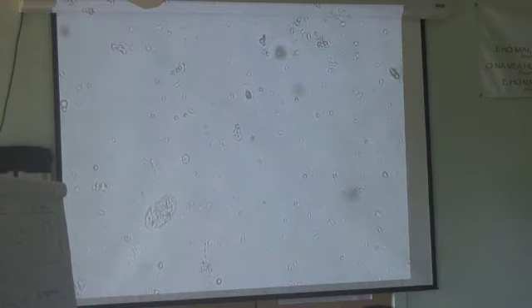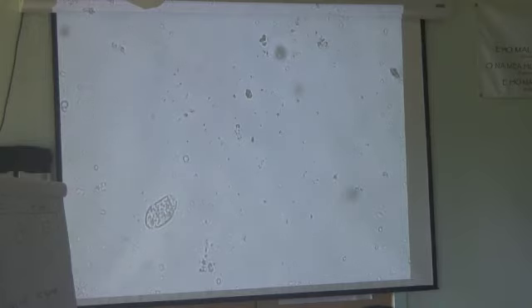There's a testate amoeba. So now we've got an amoeba in this picture. So we've got to add those into our list.